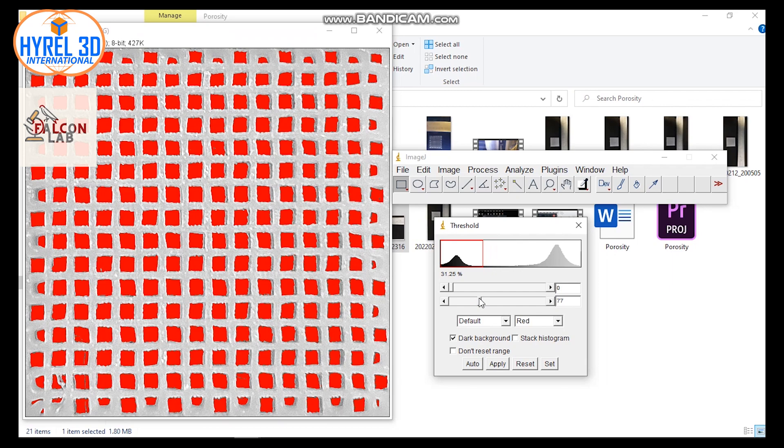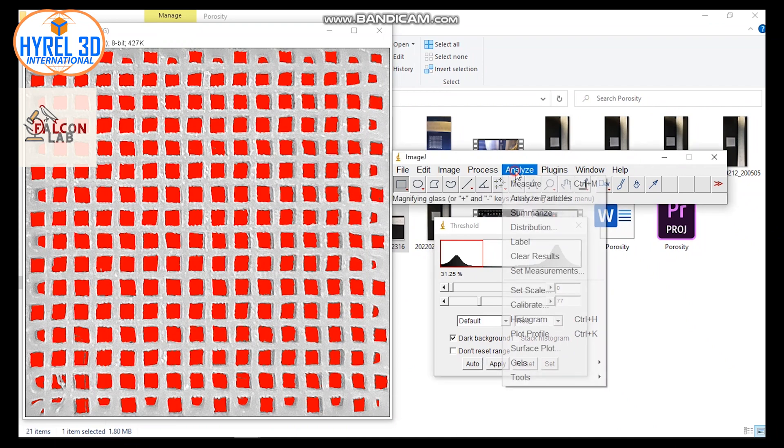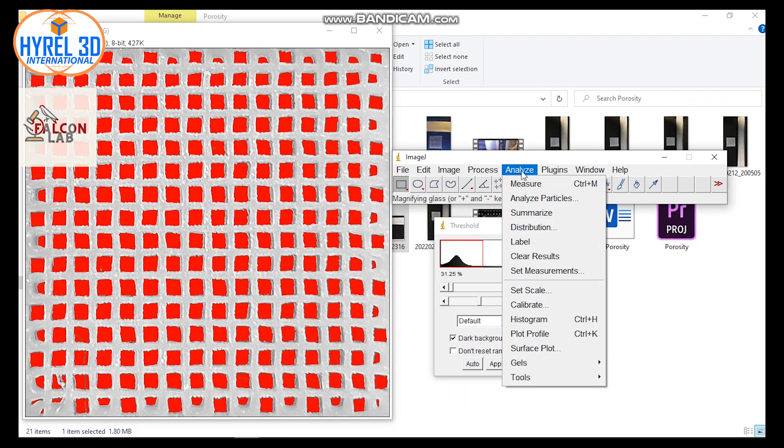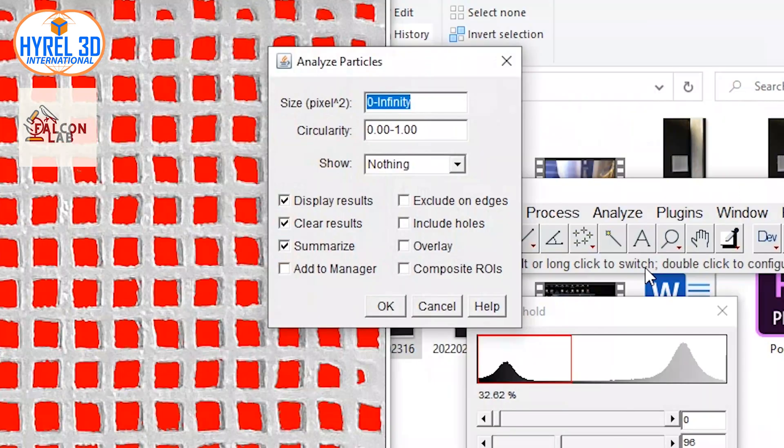If you are not aware of this, this may affect your calculation. Next, go to Analyze and choose Analyze Particles. You can add a limit of your pore size by changing the number in the Size column. For example, any pore size smaller than 0.001 will not be calculated.